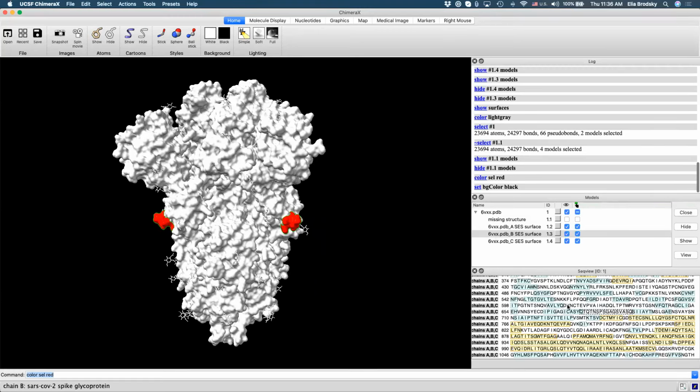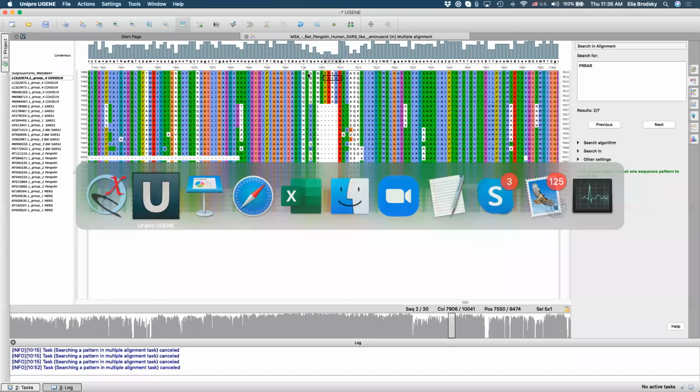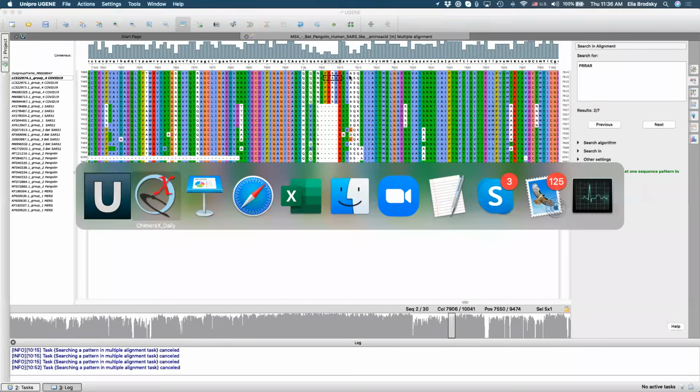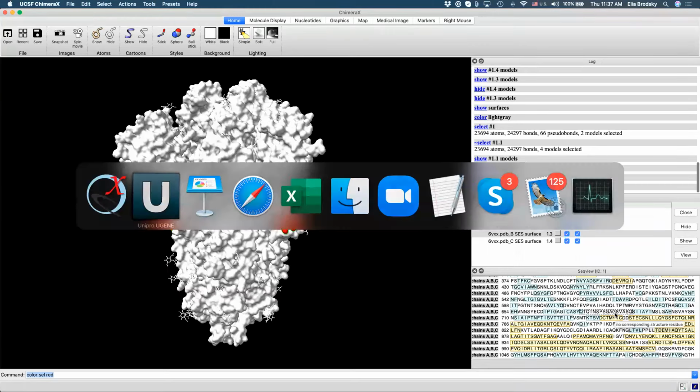So if we look at this sequence, QT, QTN, and then whatever comes after, right? Let's go back to what we have here, QT, QTN, right? And then we have this insertion, PRRA or SPRRAR, right? And then what do we have here? Where does it continue? PSGAGS.